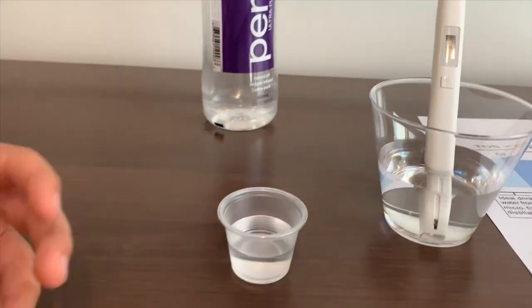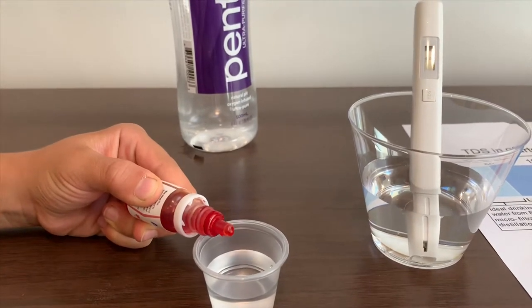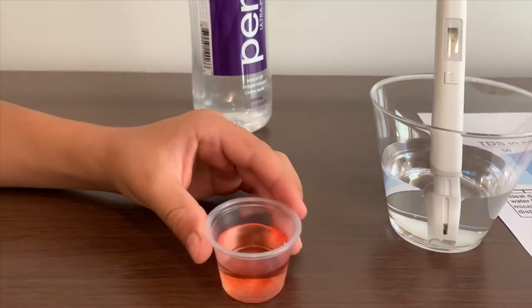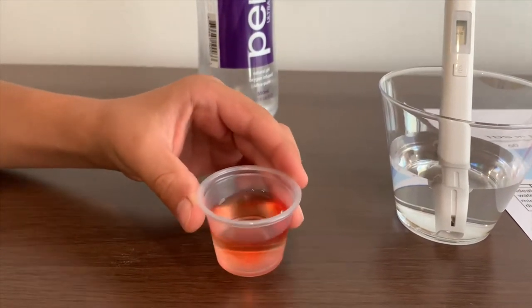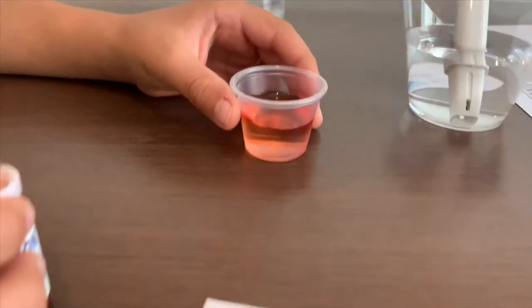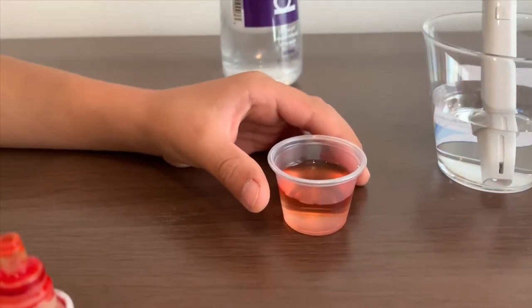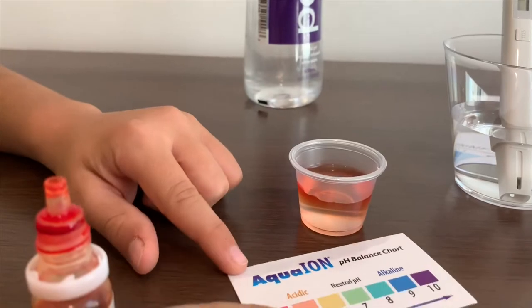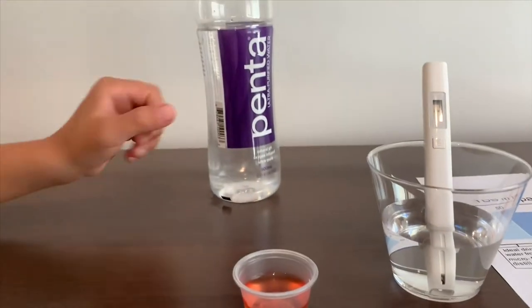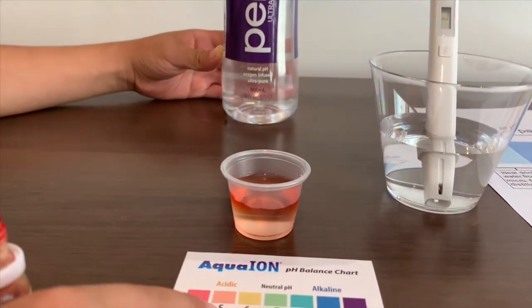Now let's test the pH levels. This is around 4.5. That is very acidic. So Penta is not that naturally high pH.